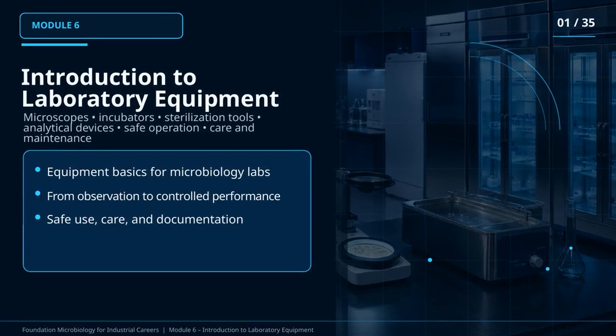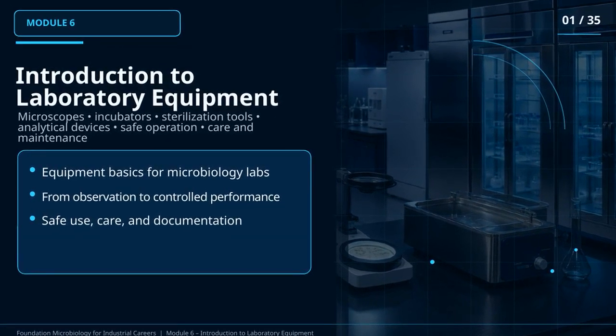Welcome to Module 6, Introduction to Laboratory Equipment. This module explains the essential tools used in microbiology laboratories and the principles that make them reliable, safe, and fit for purpose.